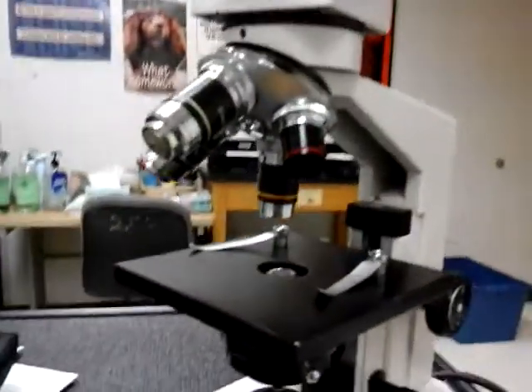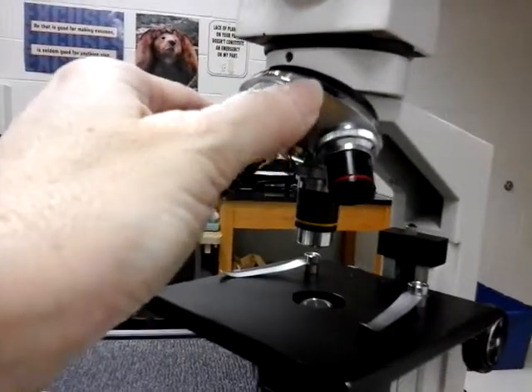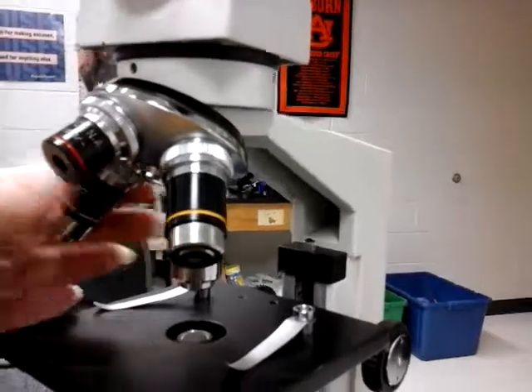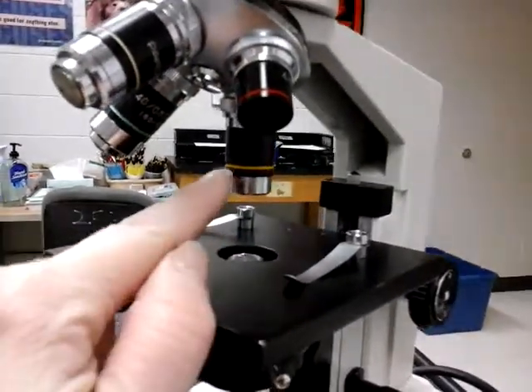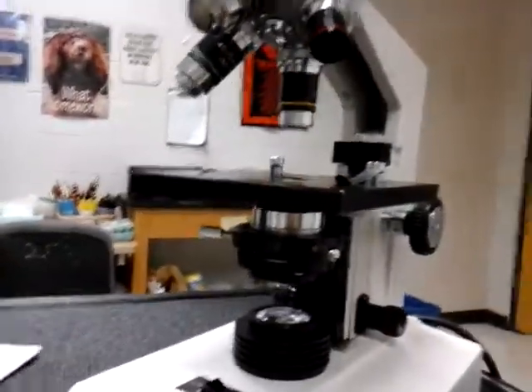And then when you want to change the power, you turn this thing right here. This is what we call the nose piece, and the nose piece turns, so you can change the power. Whichever one is hanging down is the one that we're going to use. So you can see here we have a yellow ring. That's what we call medium power.